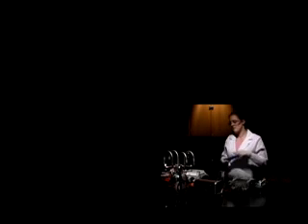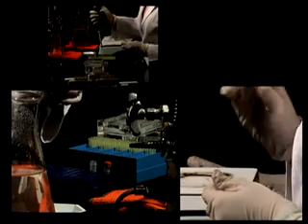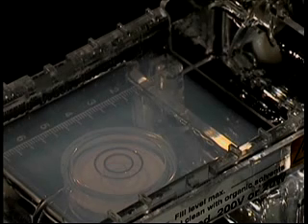The sample should be heated to 65 degrees before loading to break down any unwanted aggregates. To prepare the sample for placement in the gel, mix it with 5 microliters of gel loading solution. Then load it into a sample well, taking care not to tear the gel.